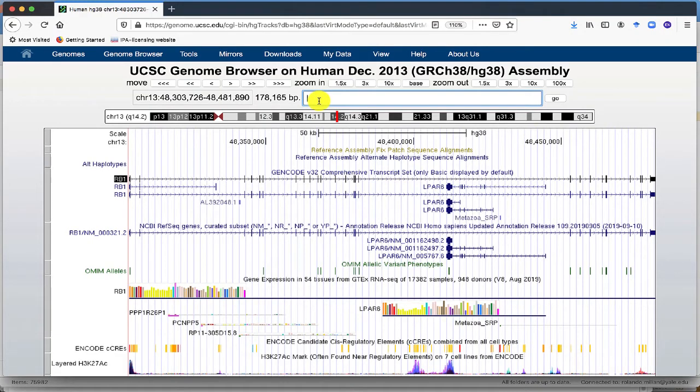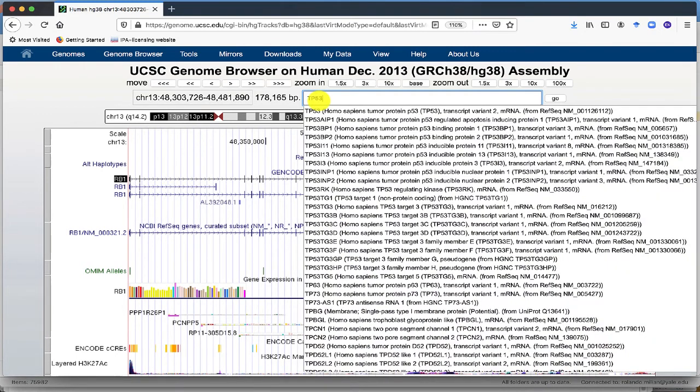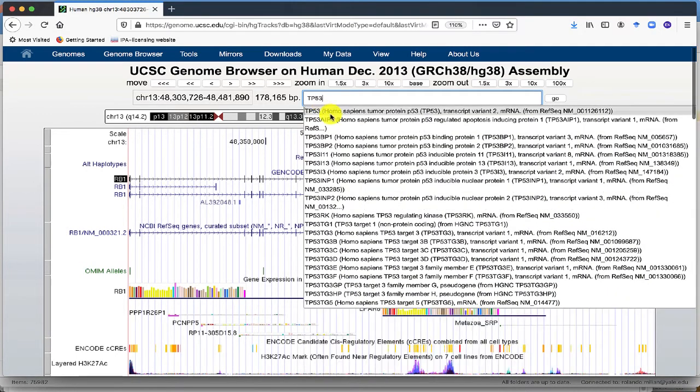Then type the gene of interest. Let's say, let's use TP53, a very well-known gene, to use in this example.